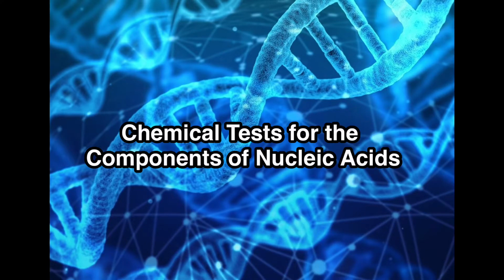Hello everyone! For today's video, let us learn about the components of nucleic acids. I will show you some chemical tests that would help confirm the presence of their specific components.